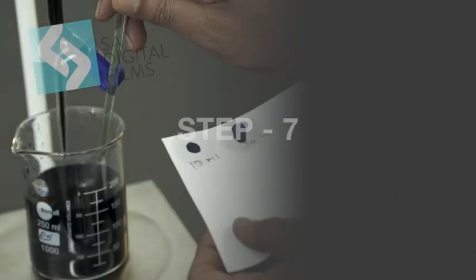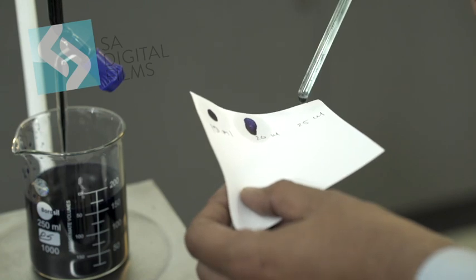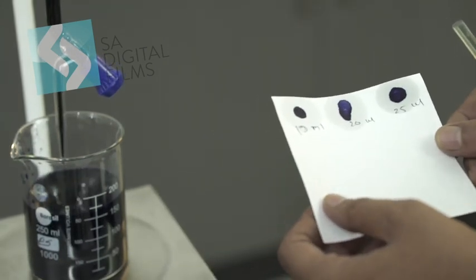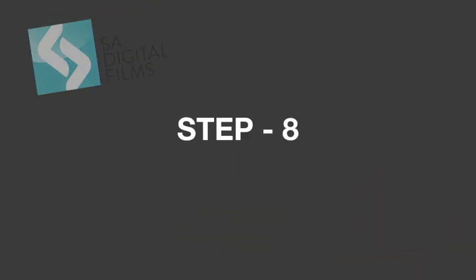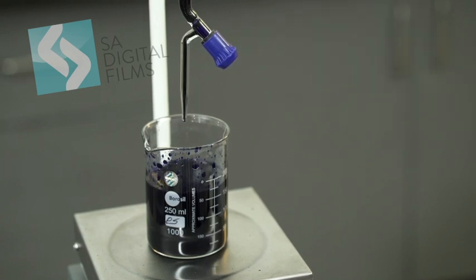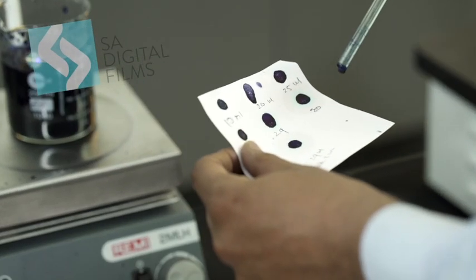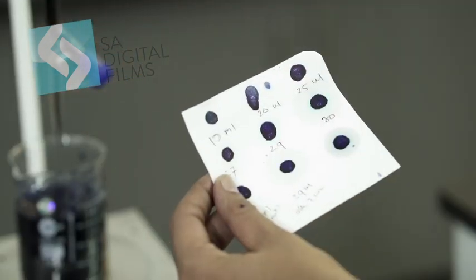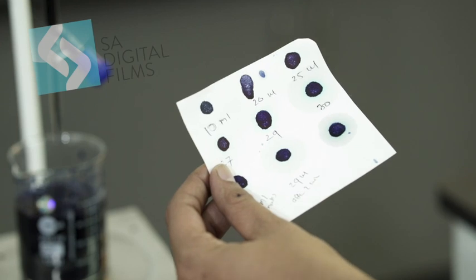Step 7. Dip a glass rod in the suspension and place a drop on the filter paper to test the presence of blue-green halo. Step 8. The sample is titrated with methylene blue in 1 ml increments, followed by 2 minutes stirring until a blue-green halo appears, surrounding the dark spot on the filter paper. Note down the volume of the methylene blue consumed.